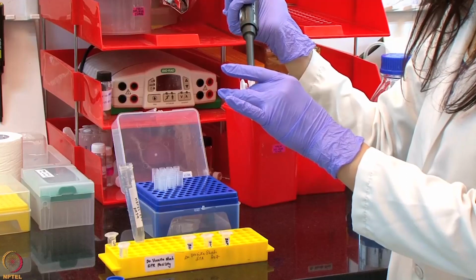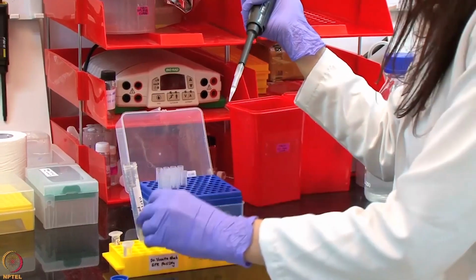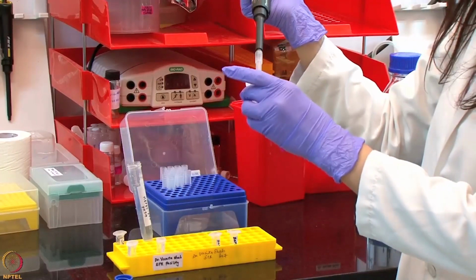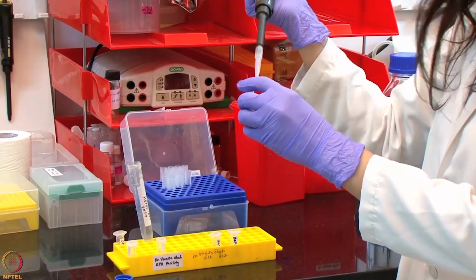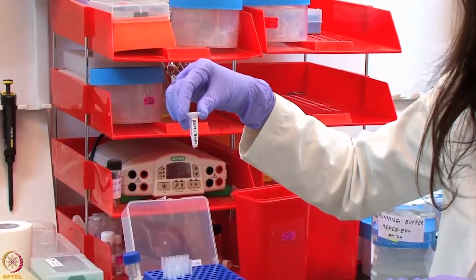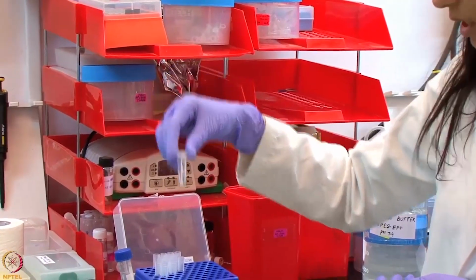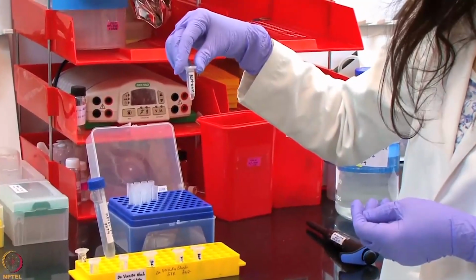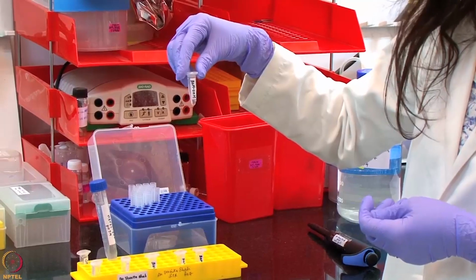We similarly continue with the dilution series for the rest of the concentrations. One of the concentrations, that is 8 nanomolar, will be run in duplicate, and we will also include a 0 nanomolar concentration in the experiment.